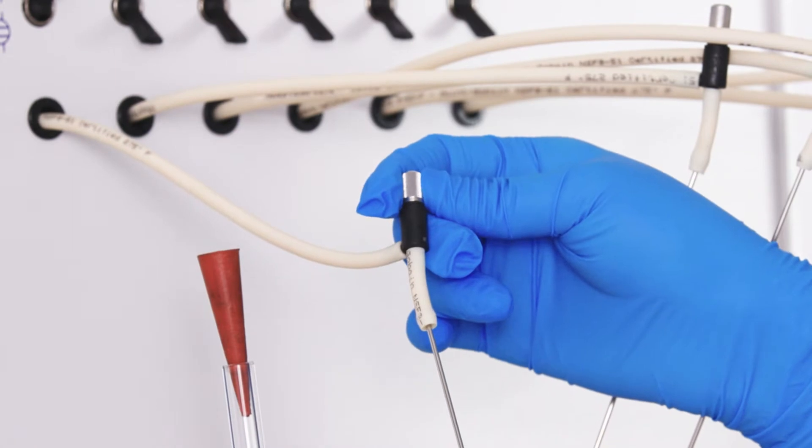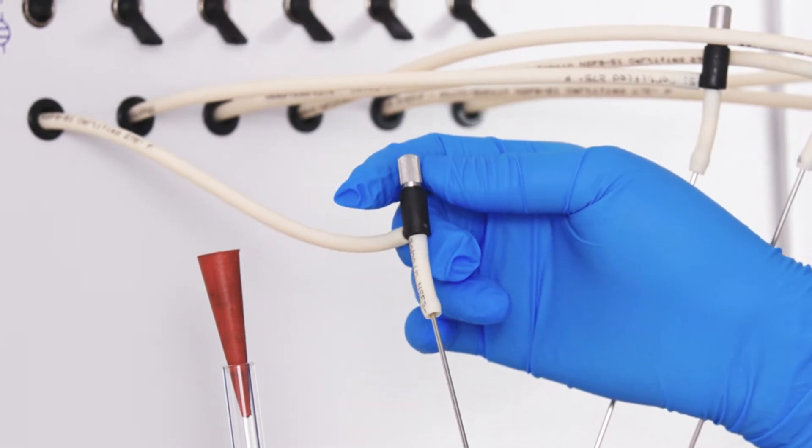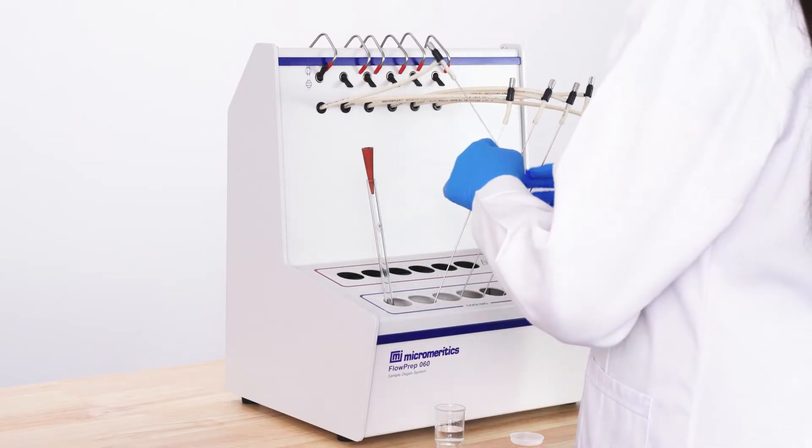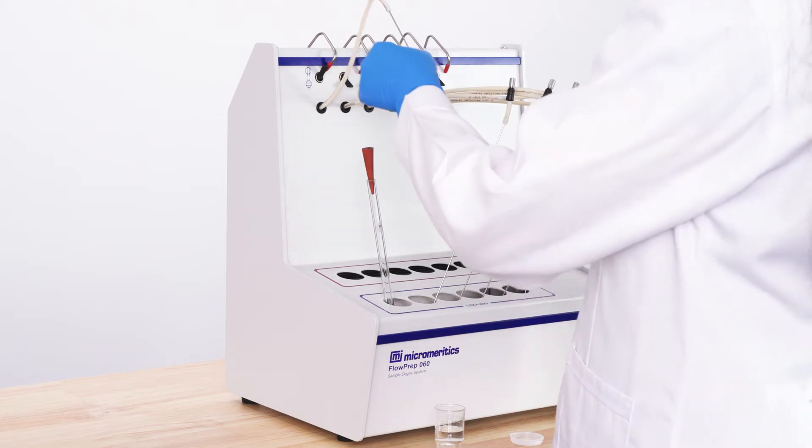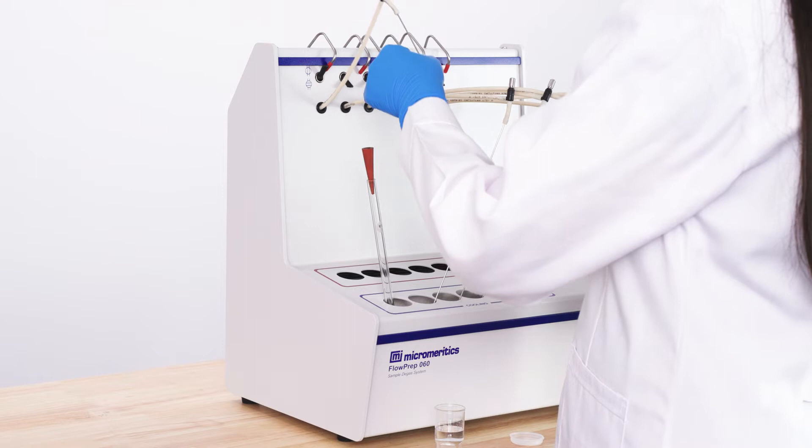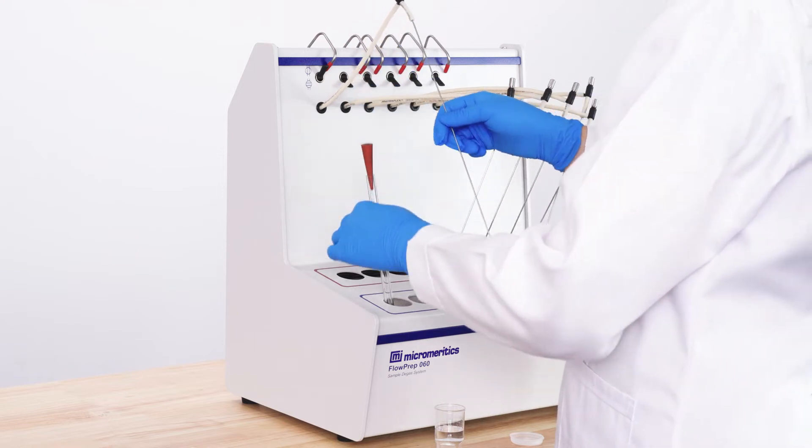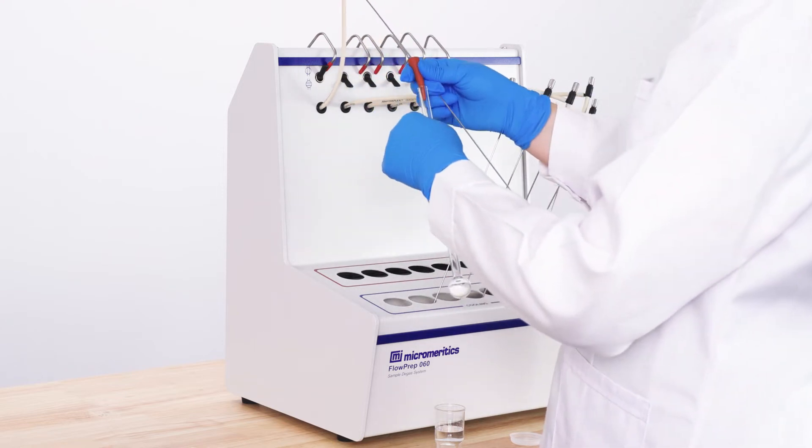Turn the knob on the top of the probe to adjust the flow. Wipe the tip clean and insert it into the bottom of the sample tube.